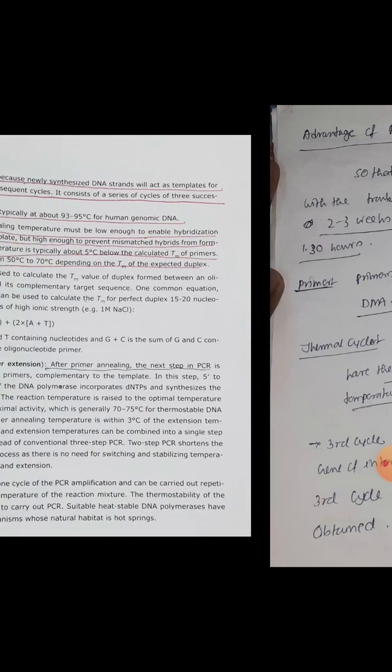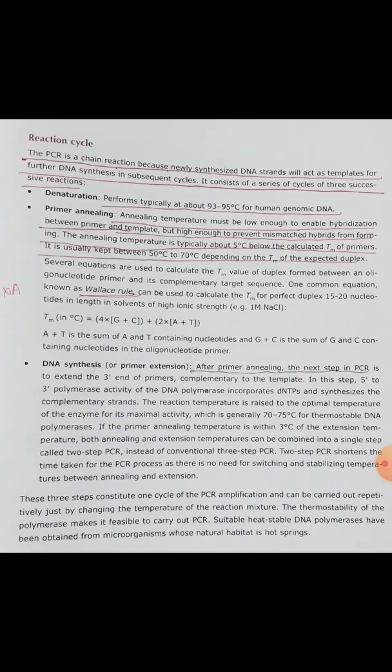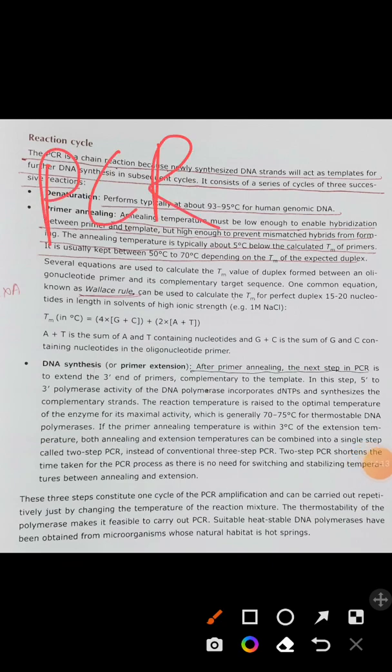Okay, so now let's enter the main steps of the PCR. As PCR's name suggests, it is a chain reaction. What does it mean?